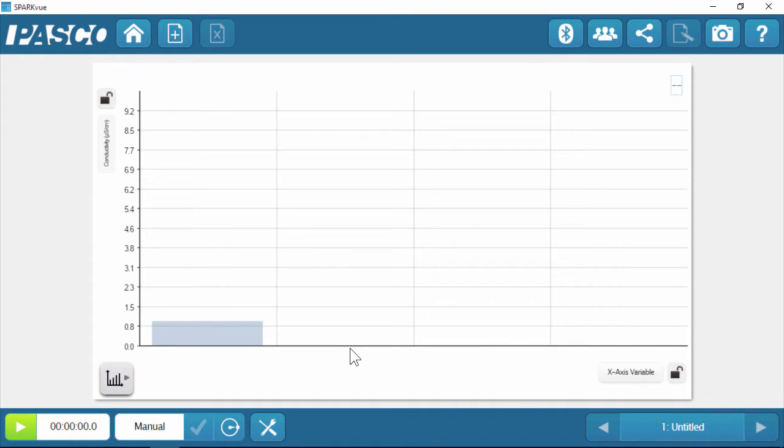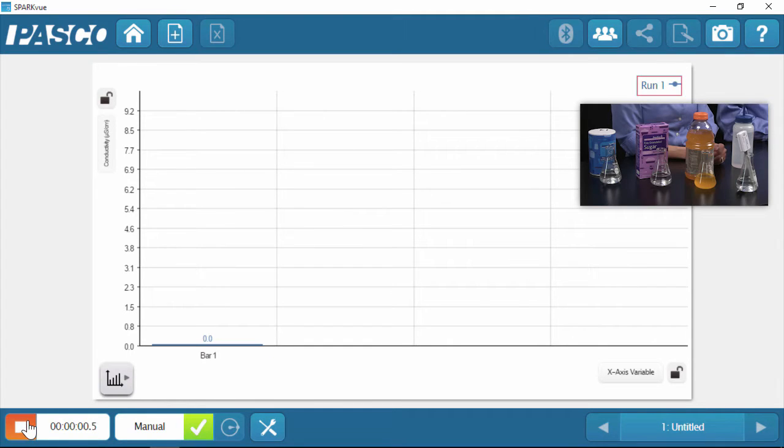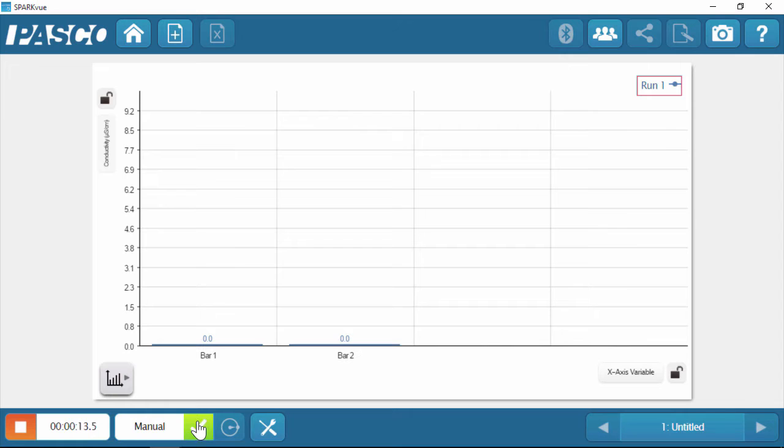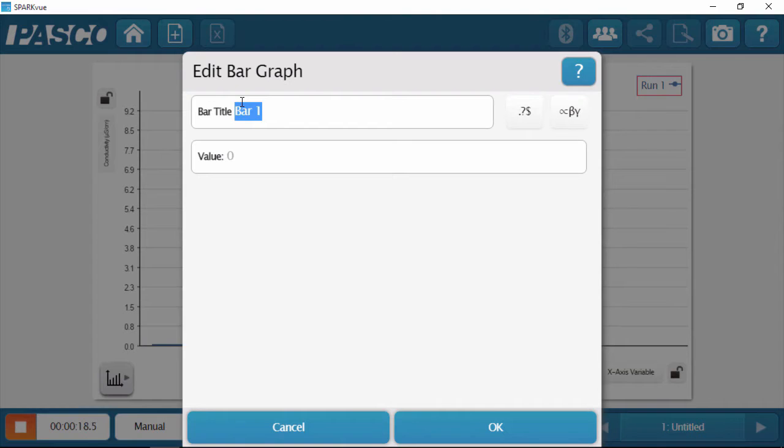I'm going to go to my software and set this up so I can see the display a little better. I'll turn off the predictive bar and turn on the numbers over the bars in my bar graph tools, so that students will be able to see the bars fluctuating and the numbers on top. I'm going to start my data collection. Bar one for distilled water is reading zero — and I would expect that, it's distilled water so it should have a low conductivity. Now that the number is stable, I'm going to hit keep and rename this bar distilled water.